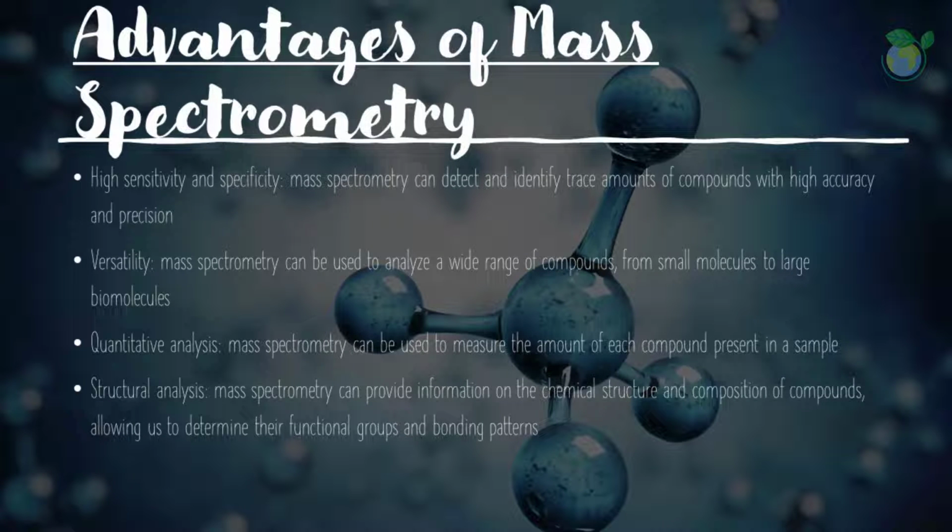Advantages of mass spectrometry. Mass spectrometry has several advantages over other analytical techniques, including high sensitivity and specificity. Mass spectrometry can detect and identify trace amounts of compounds with high accuracy and precision.